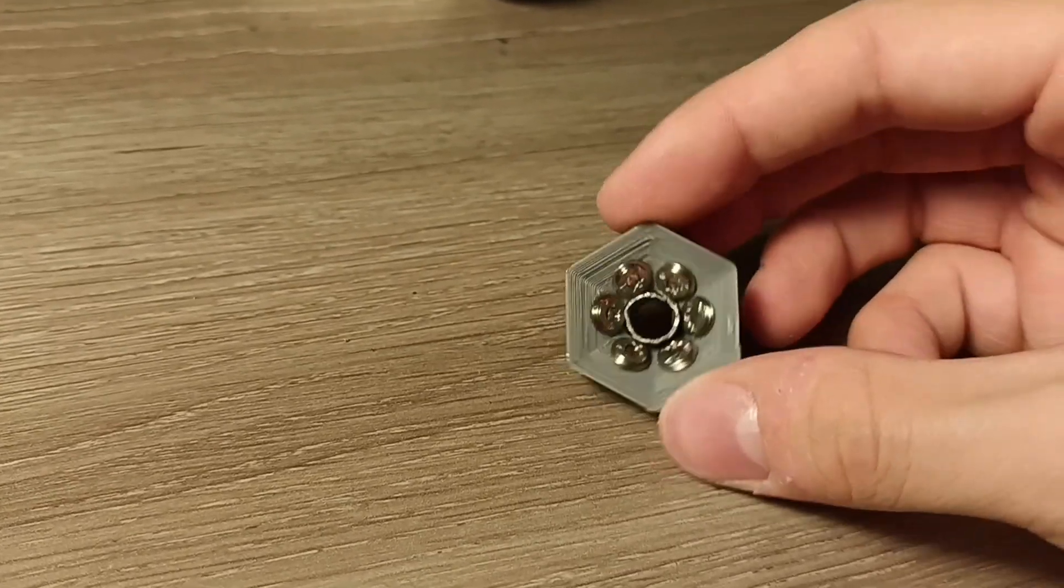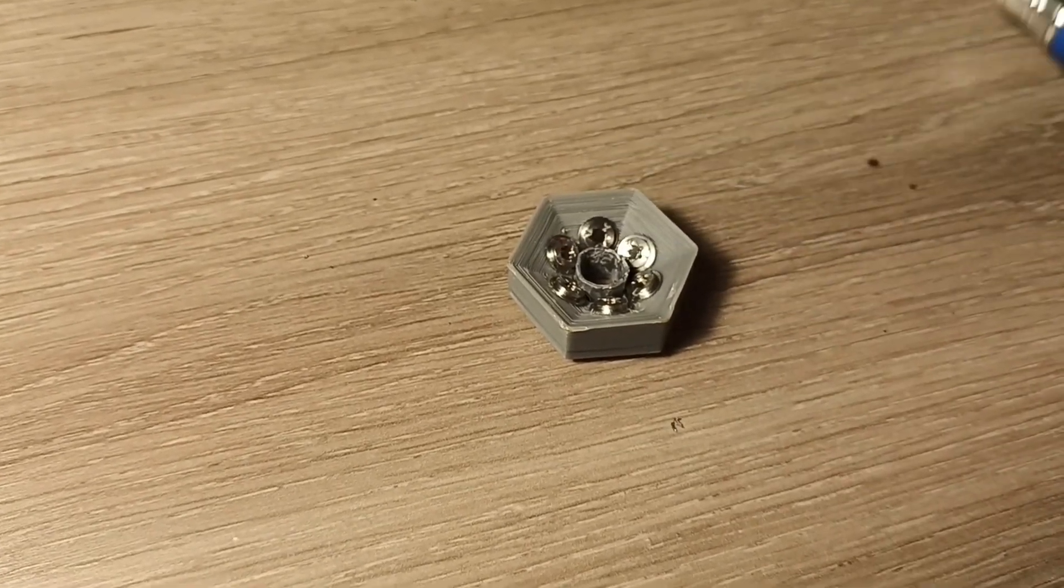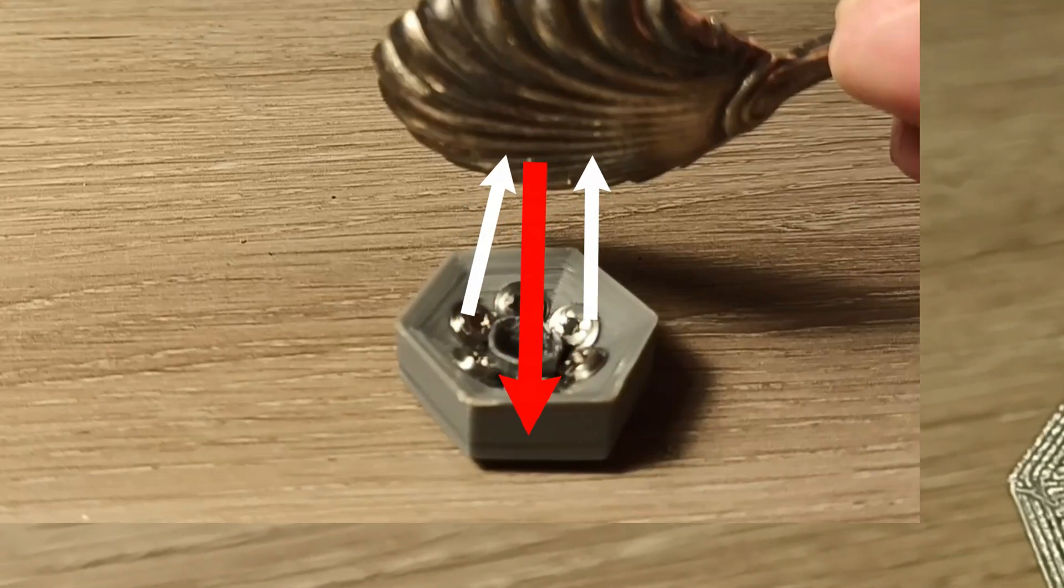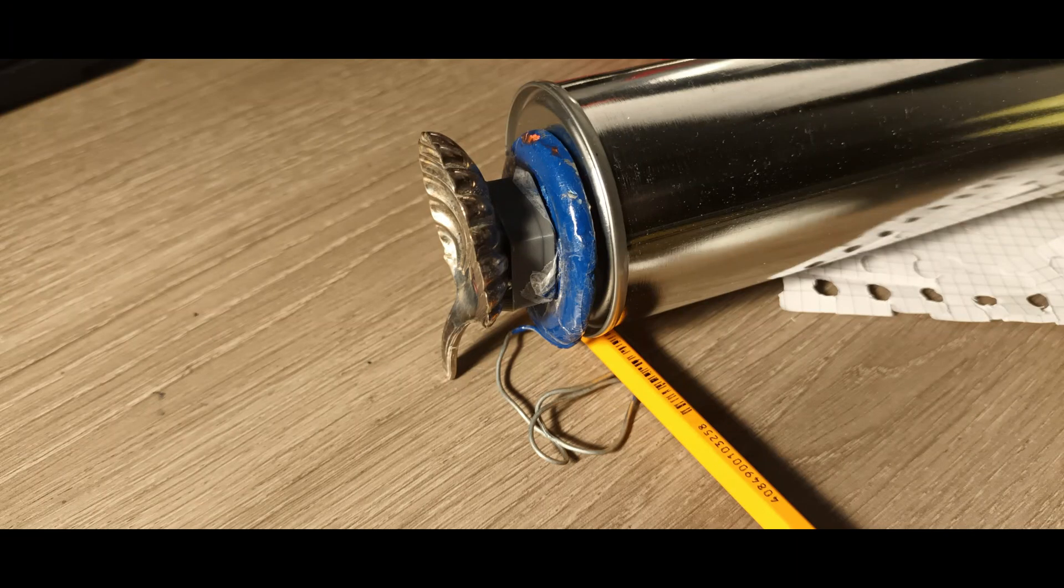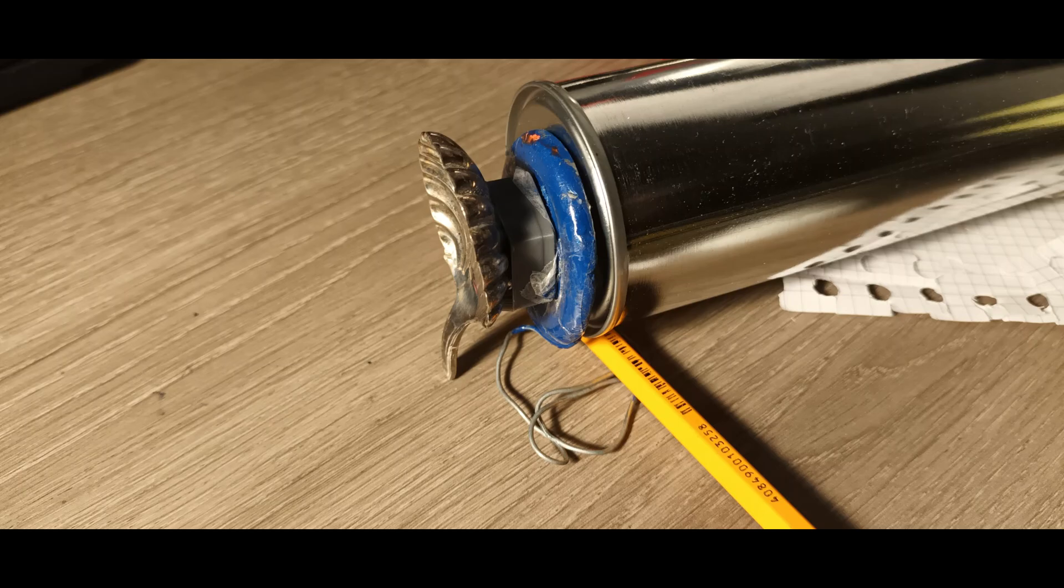I made this source. It is simply six americium capsules arranged in a circular pattern that shoot the X-rays towards the sample and the characteristic X-rays emitted by it then come through the hole in the middle and go to the detector. It is easier this way than for example using an X-ray tube because it doesn't need to be powered. One of the problems of this configuration is that the emitted rays from the source get also into the detector, but the easier solution is to subtract the background from the spectrum that we get instead of building a setup with a lead screen to block the rays coming from the source, because this reduces too much the counts because of the added thickness of the lead itself between the source and the detector.